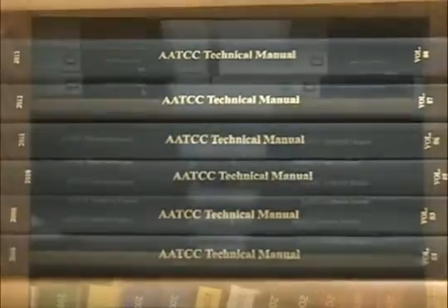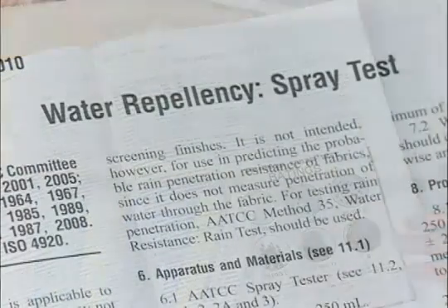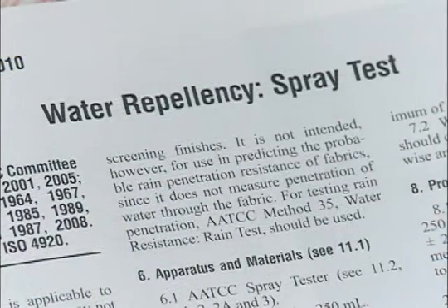The principle of the AATCC-22 Water Repellency Spray Test is to judge the pattern of water spray on the surface of a fabric specimen under controlled conditions using a visual rating scale.